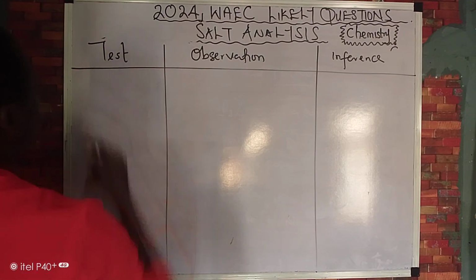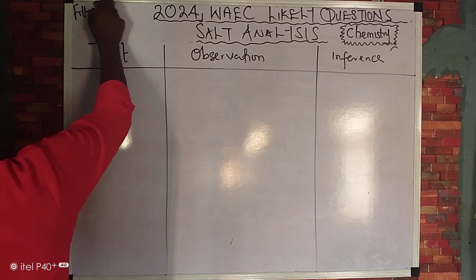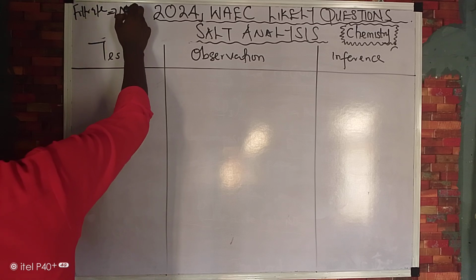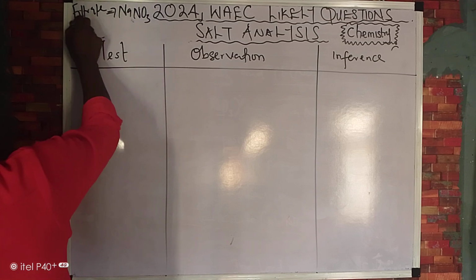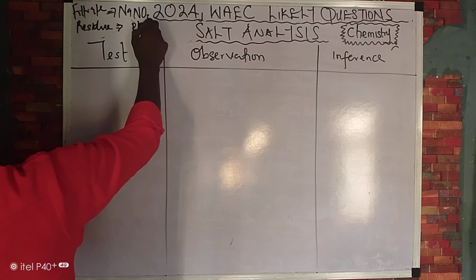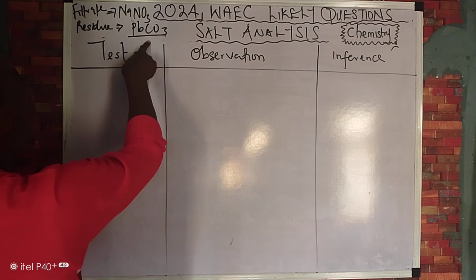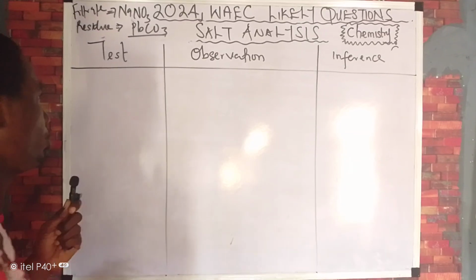Please have it at the back of your mind that our filtrate is sodium nitrate. Take note of that. Our residue is what? Lead carbonate. So with this being our residue and this being our filtrate, you have to be very careful. So let's do this part.